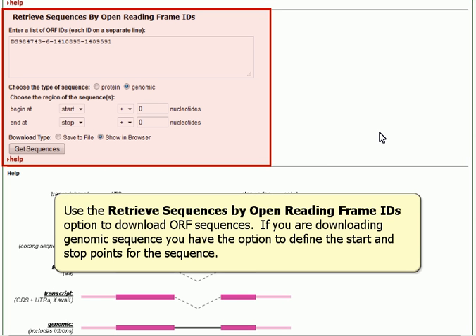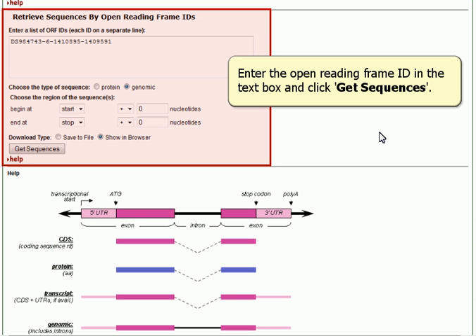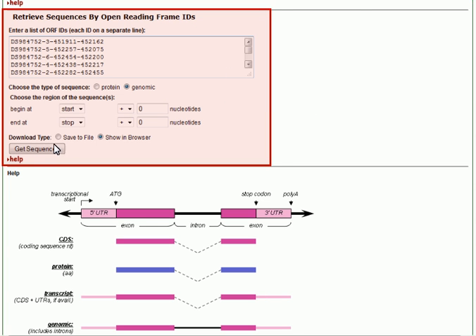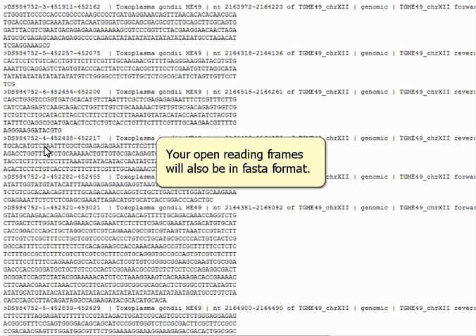Use the Retrieve Sequences by Open Reading Frame ID option to download ORF sequences. If you are downloading Genomic Sequence, you have the option to define the start and stop points of your sequence. Enter the Open Reading Frame ID in the text box and click Get Sequences. Your Open Reading Frames will also be in FASTA format.